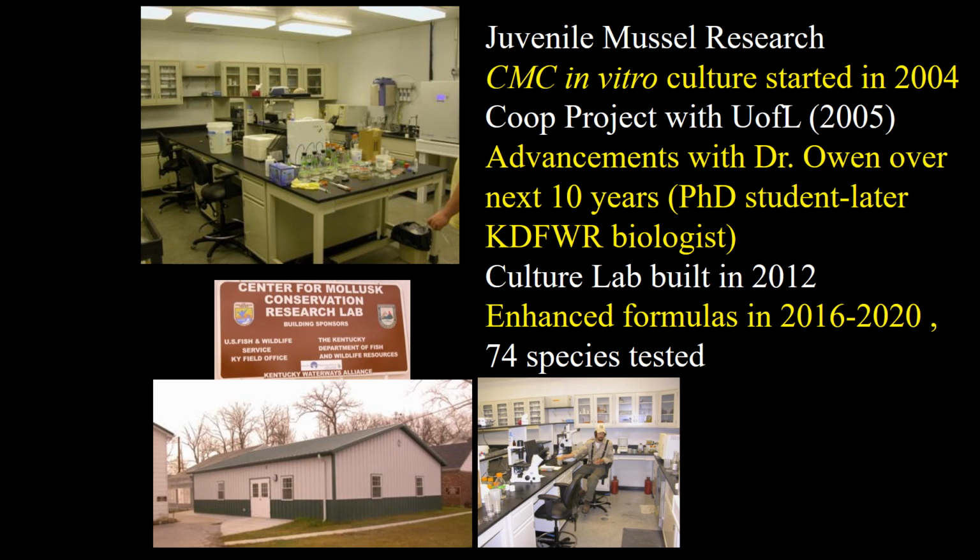Today, at the Center for Mollusk Conservation, we do a lot of different mussel research projects. We started the in vitro project in 2004 and realized it was going to be really difficult for us to do, so we partnered with the University of Louisville graduate program. We had a PhD student, Christopher Owen, who over the next 10 years graduated, became a postdoc, and was hired on here at the staff to enhance these formulas. We basically created a formula that worked for a lot of species, and over the years we've tested over 70-something species that work in this in vitro culture media.